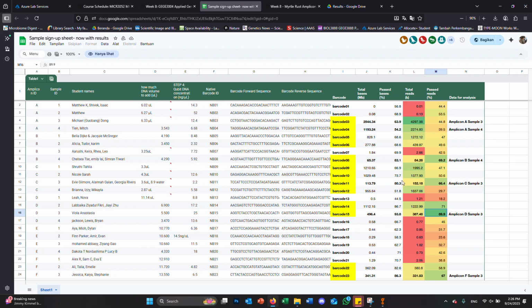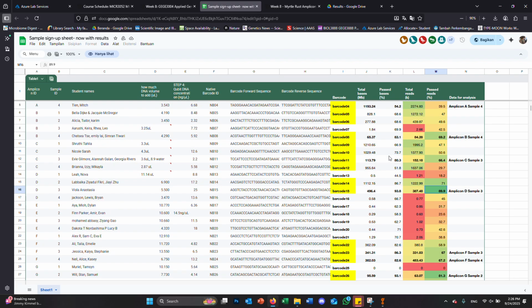I want you to look at these two plots. If you haven't got HTML files loaded and working yet, don't worry so much. We're just going to be looking through these particular charts. What do you see that's different between the Nanopore one and the Illumina one? What are some obvious differences that have sort of popped up?